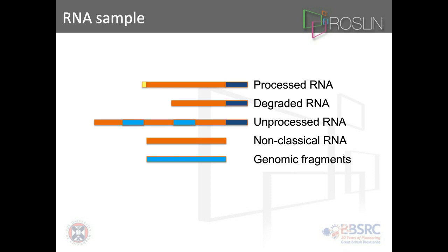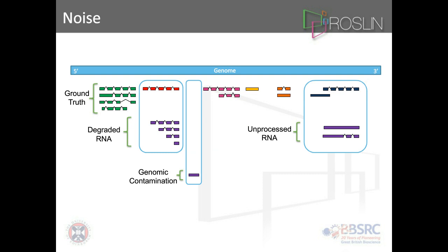What that looks like is: degraded RNA produces what I call a 5' exon cascading event, where you get reduced representation on the 5' end but the 3' end all matches, so you don't actually get the true 5' end for that transcript. Genomic contamination typically looks like a single exonic gene somewhere randomly within the genome. Unprocessed RNA will either have all introns intact or some introns intact — sort of mid-processing essentially.